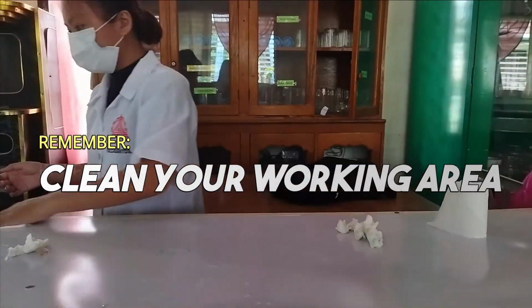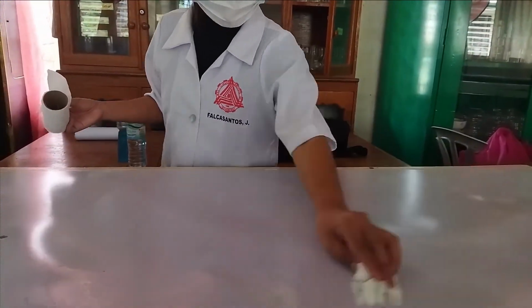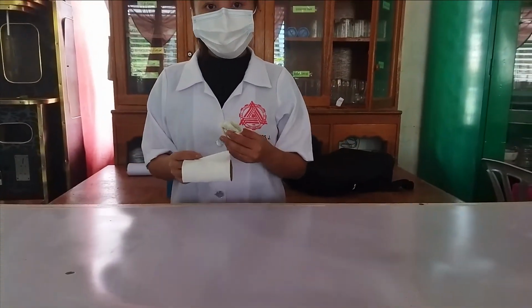Do not forget to clean your working area after every experiment to avoid accidents and to also maintain the cleanliness of our laboratory.